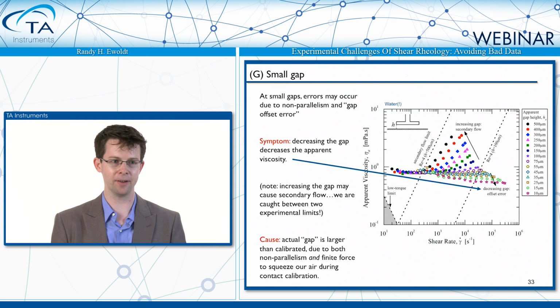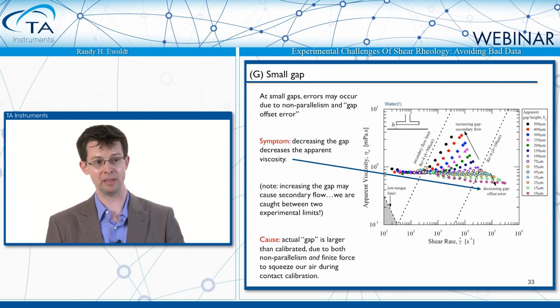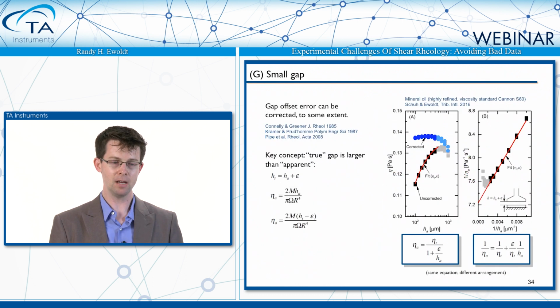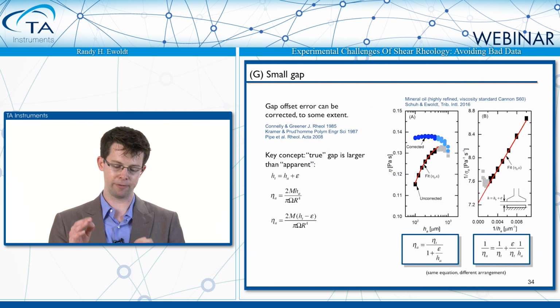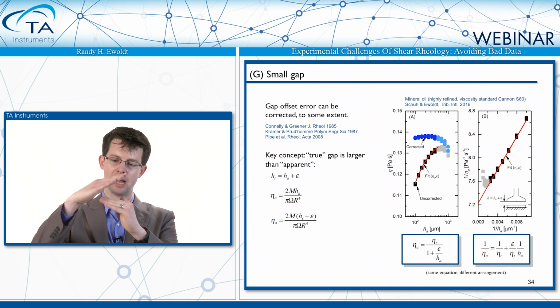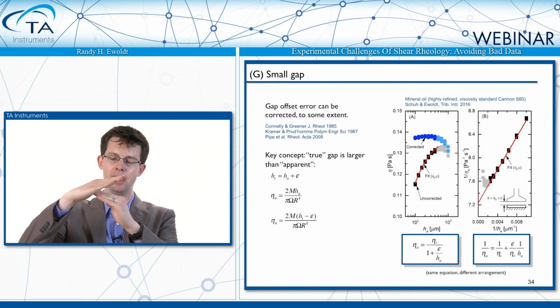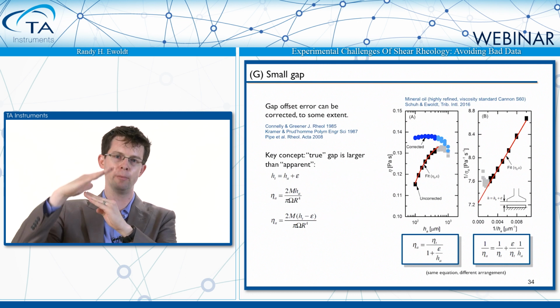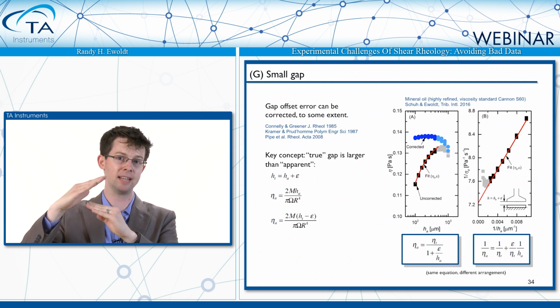So in this case, going down to 10 microns, be careful with your Peltier plates. If you take things down to 10 microns, you might scratch some of them. But in this case, that was a limit where we started to see this effect. There's another effect here, not just the parallelism, but sometimes as you get the plates very close to zero them, there's another offset error where you think you've contacted because you're looking for a measurement force, but you haven't quite contacted yet.